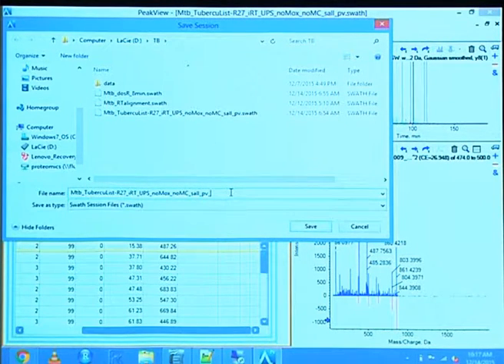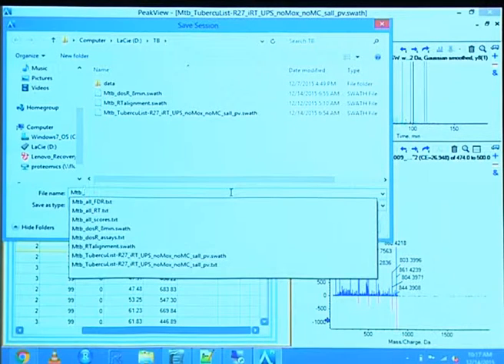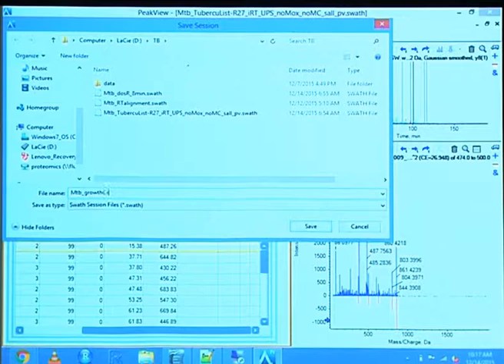So I used a gradient curve data set. We used 8 minutes, 6 transitions, and 75 ppm.